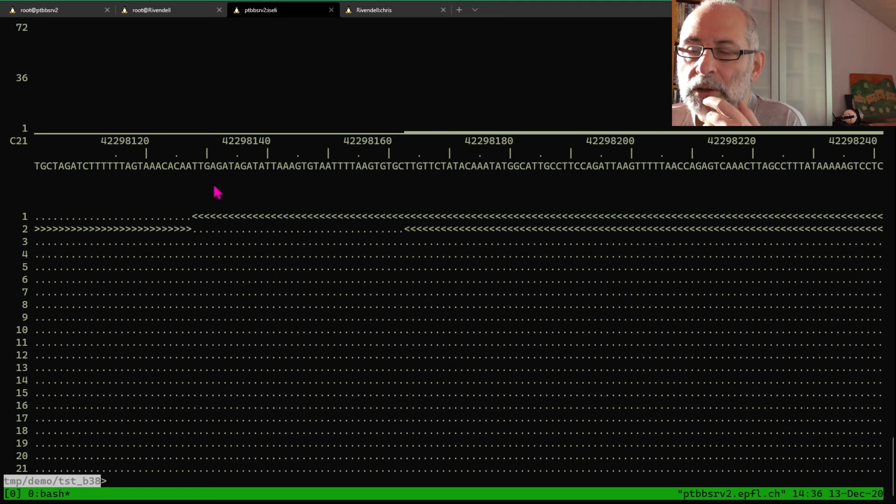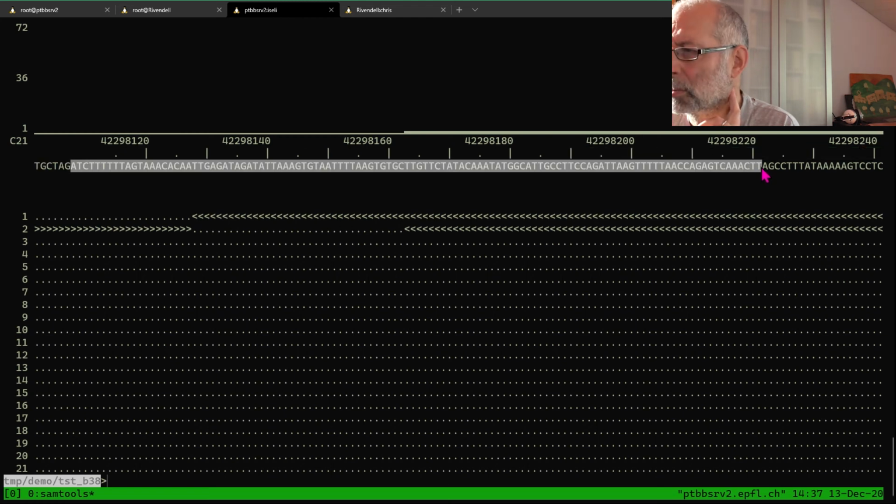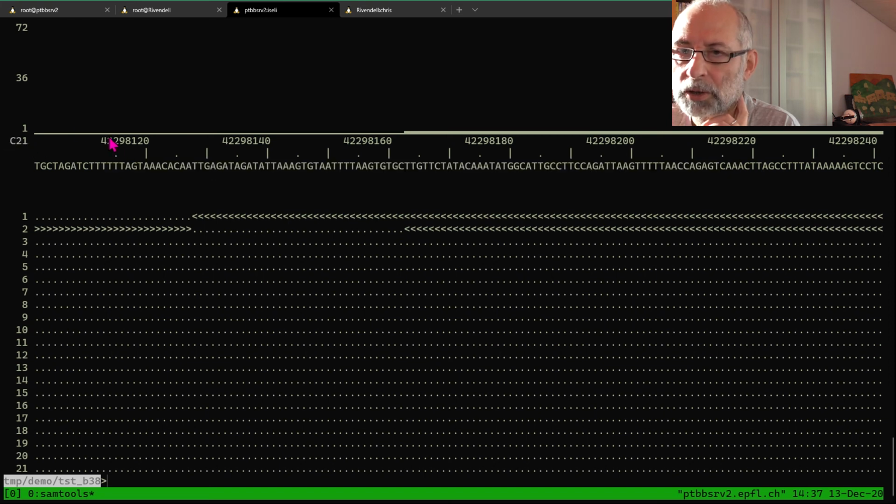on the top part, of course, here it just has one read, so the coverage is pretty insignificant, but you would see a sort of pile-up of the reads to give you an idea how much coverage there is in this genomic region. So here is the sequence on the reference genome, that's chromosome 21, these are the positions, and then these are the reads.